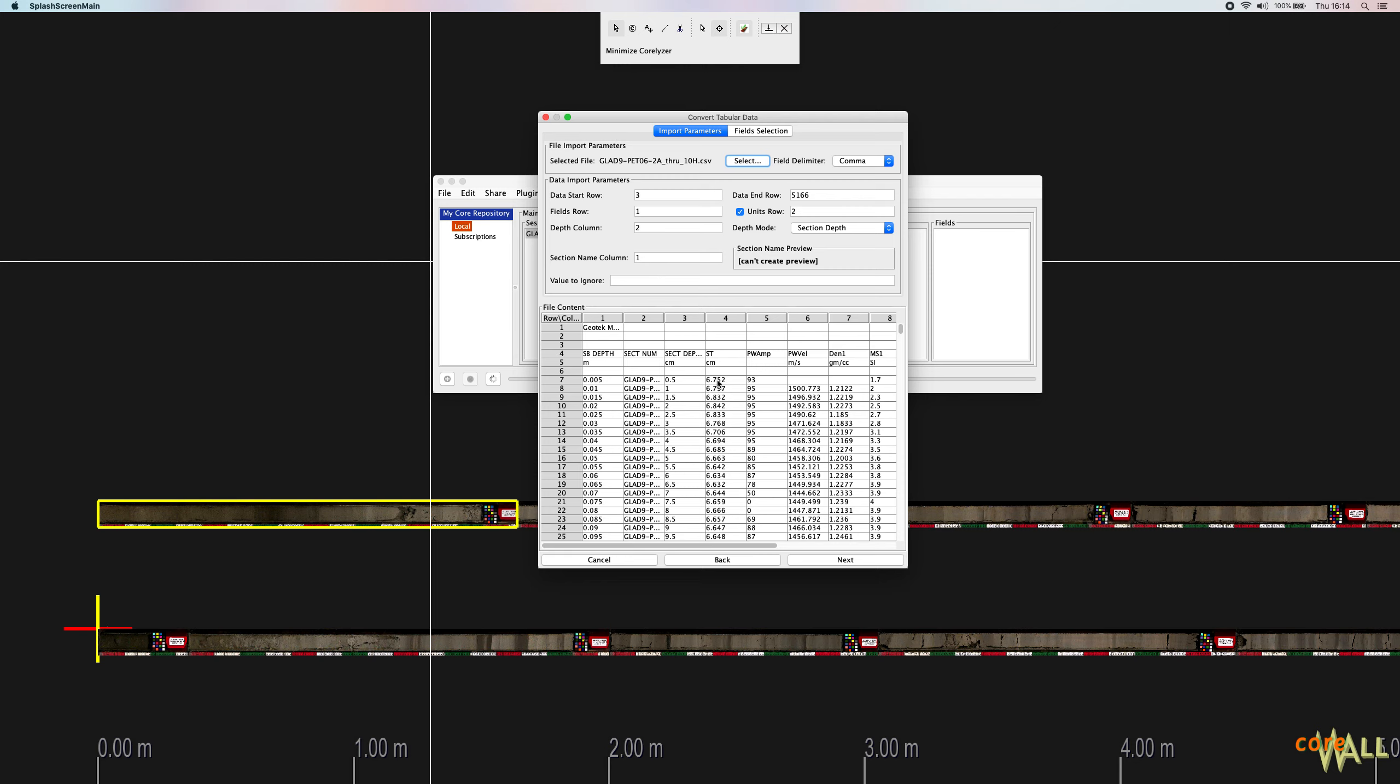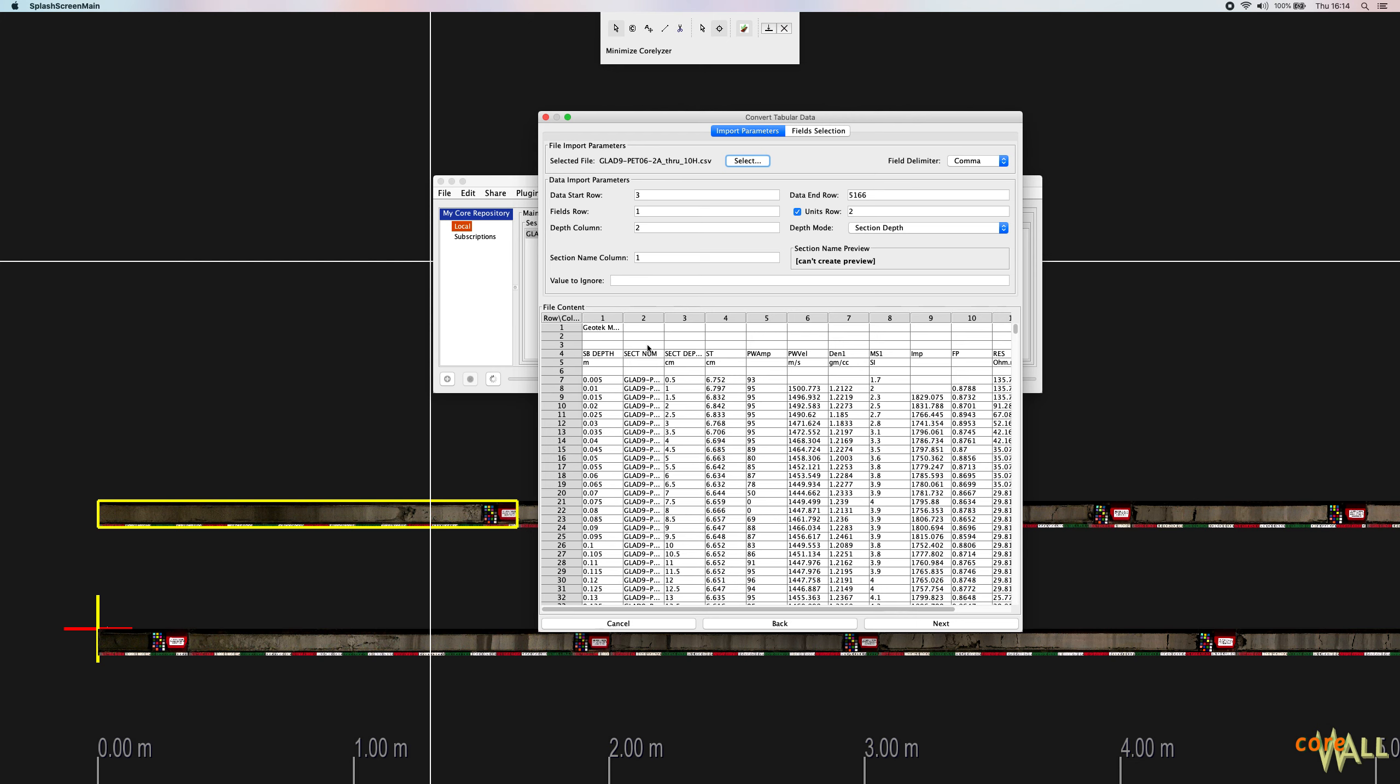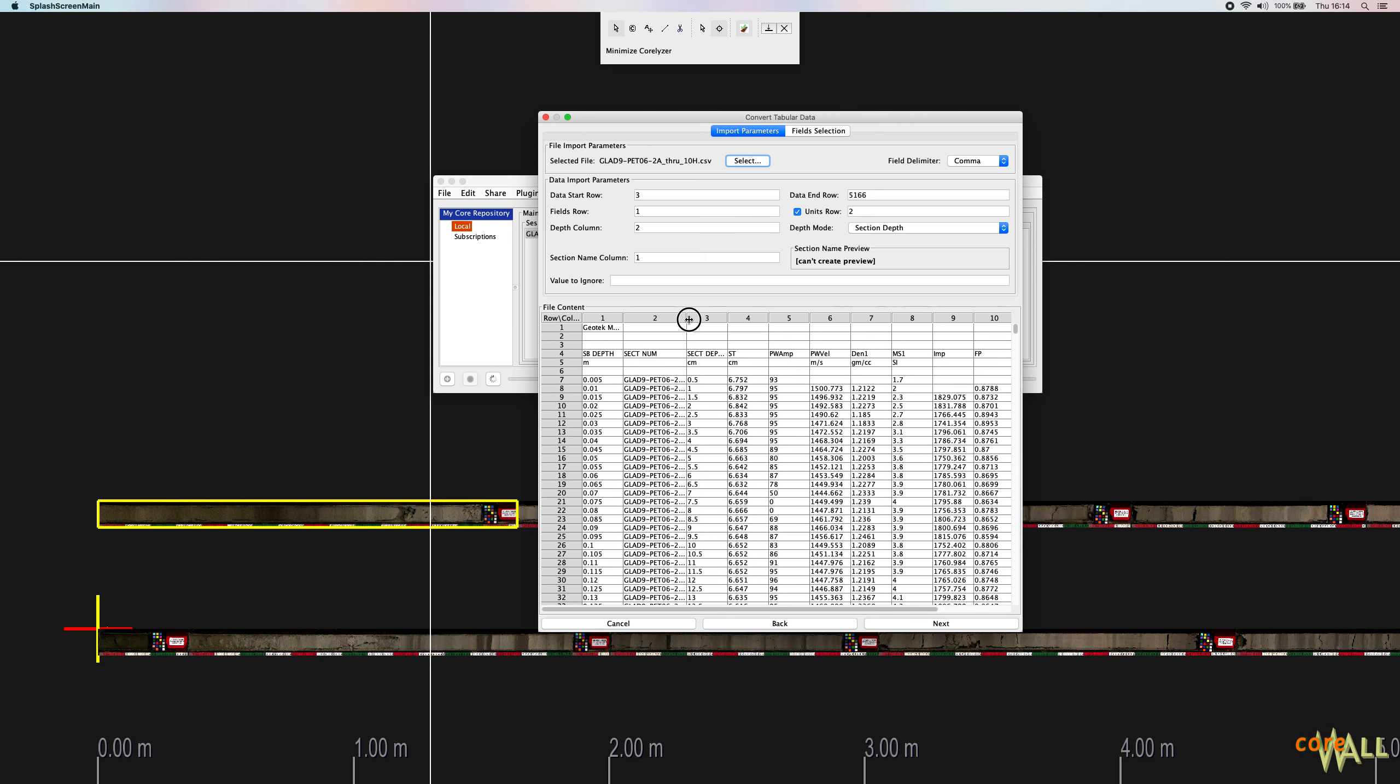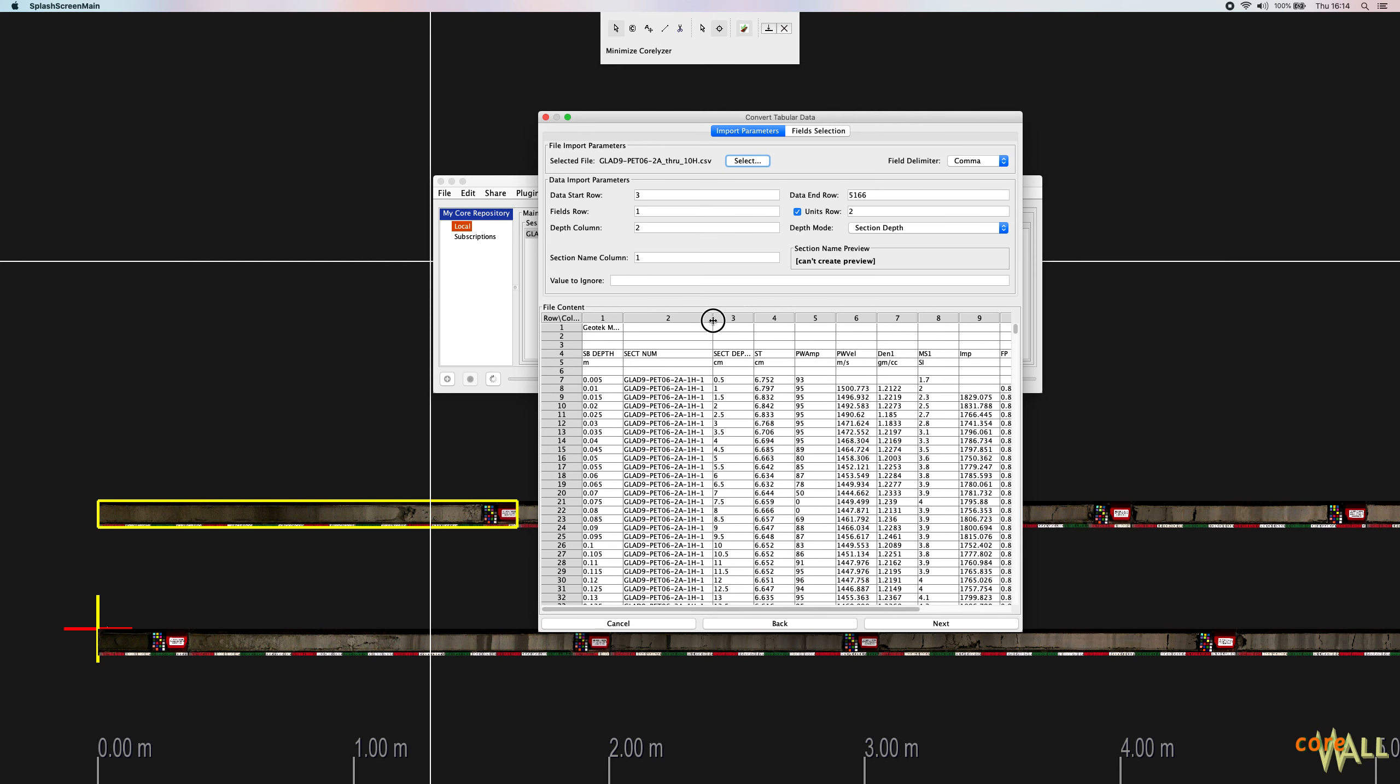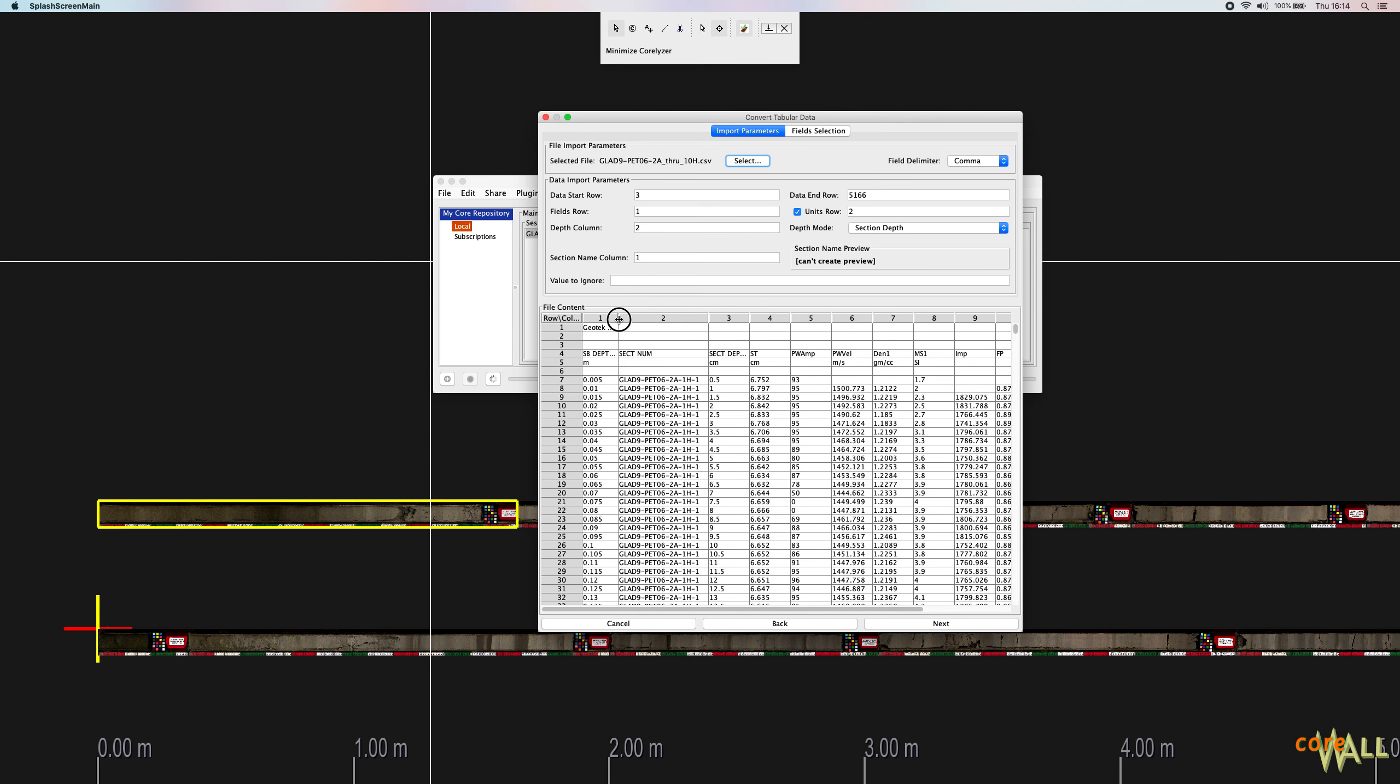The contents of the selected file appear in an Excel-like table at the bottom of the dialog with row and column numbers. You can adjust the size of columns if you want. You can see this is the contents of my file here.